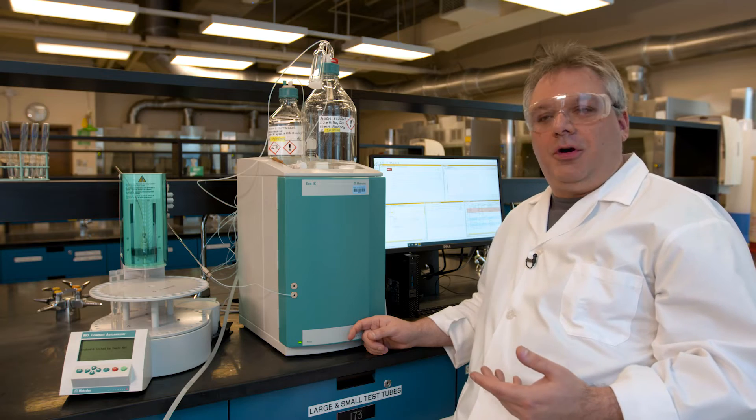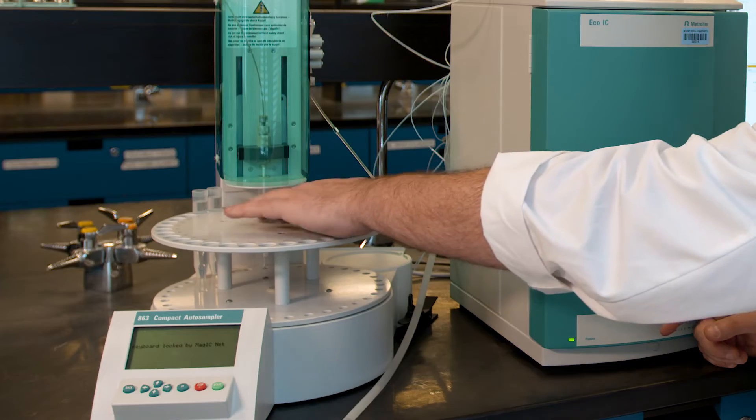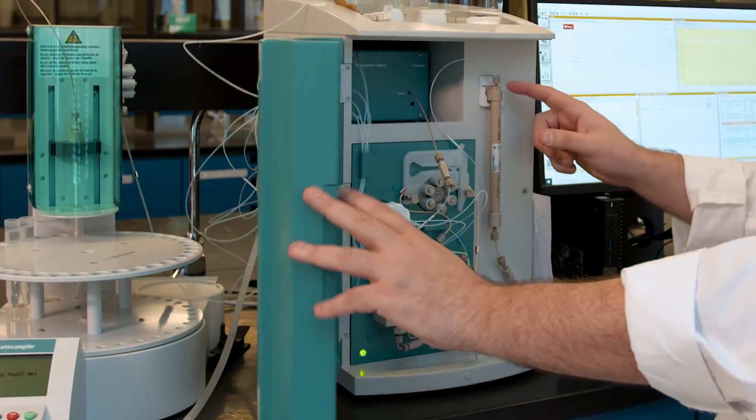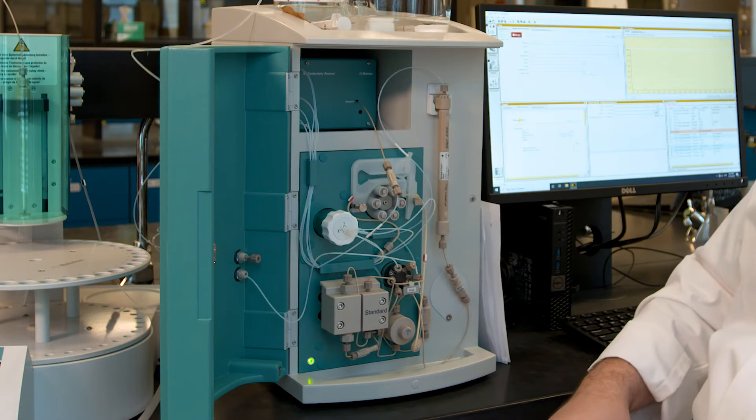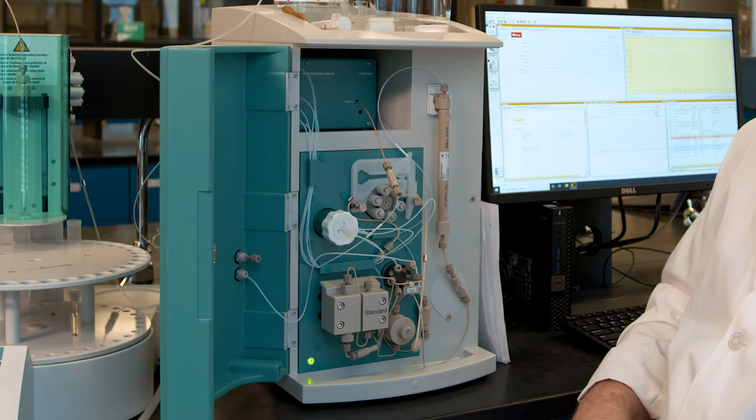So here is the ion chromatography machine. Over here is where the samples are. Inside here is the column that separates the ions itself, and in there is the detector that detects the ions after they go through the column. Let's take a closer look.